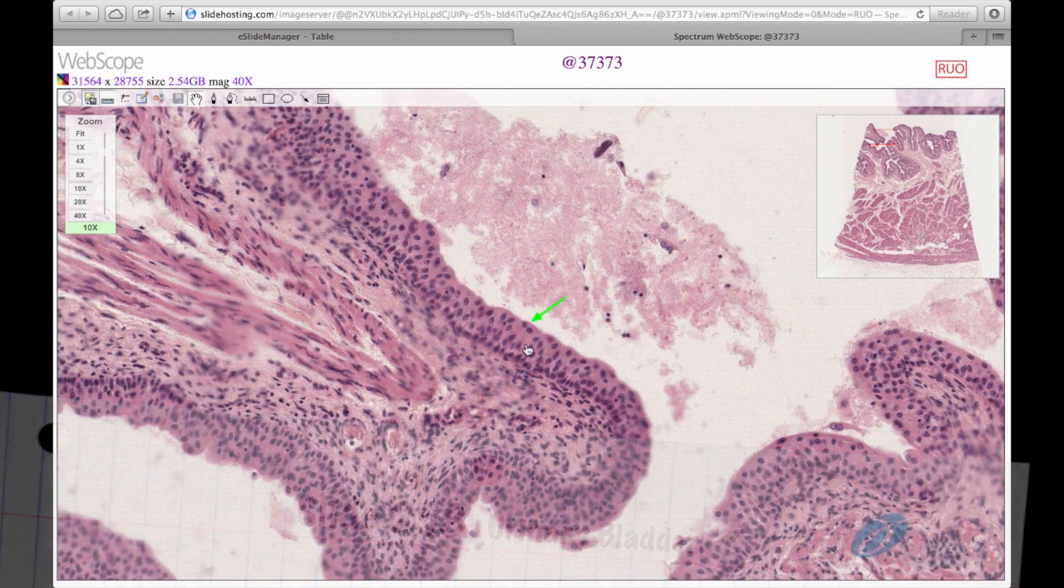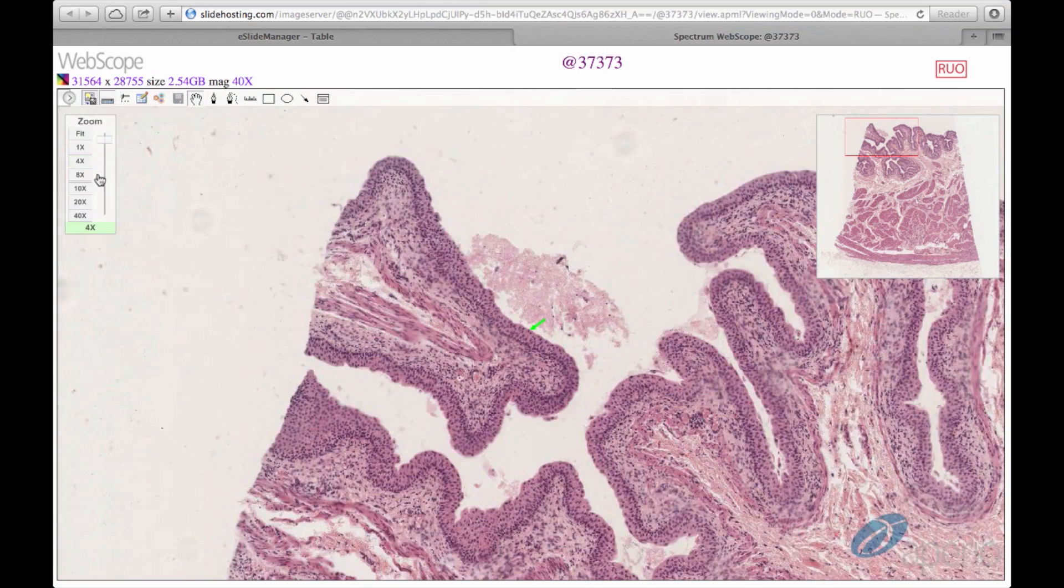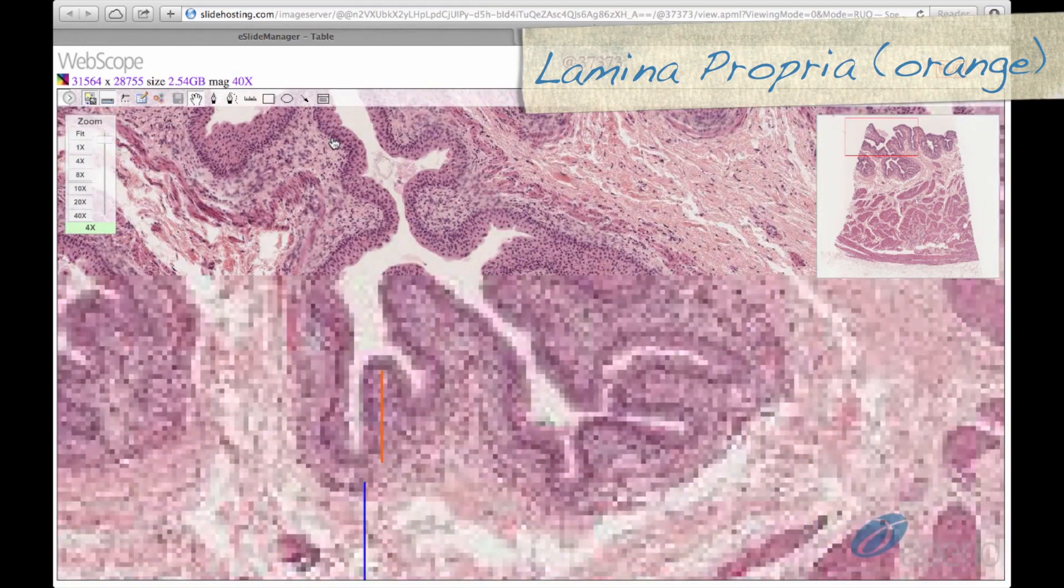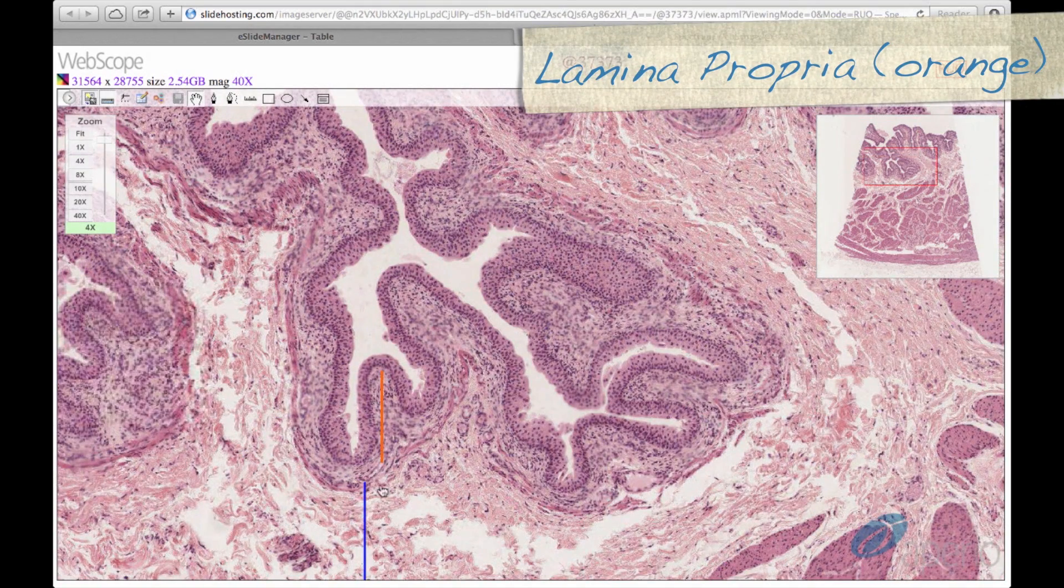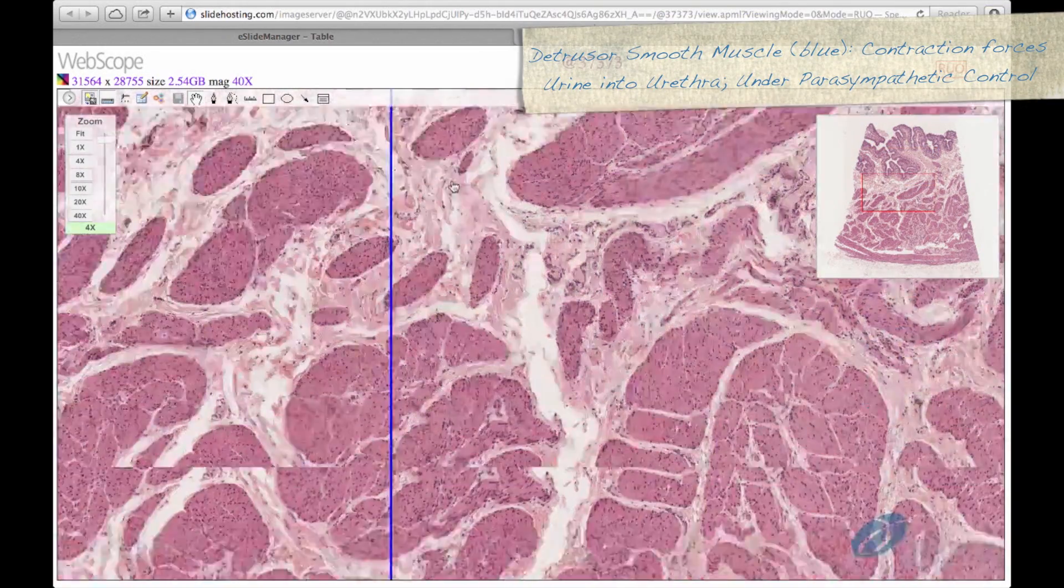Here we can see the urothelium, or transitional epithelium, at the green arrow. The lamina propria is spanned here by the orange line, and the smooth muscle layer is spanned by the blue line.